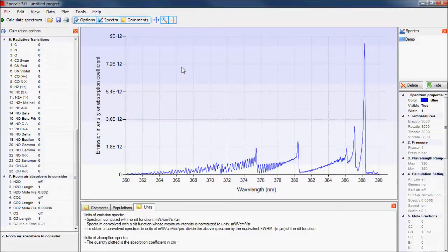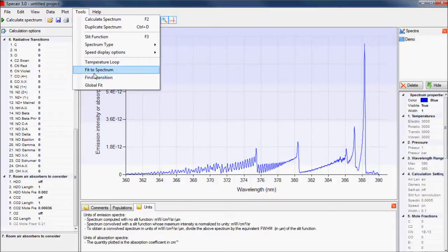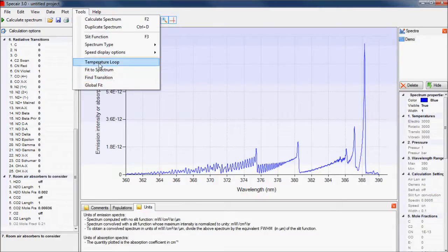The remaining options in the tools menu relate to the automatic fitting of spectra, which is described in detail in other videos.